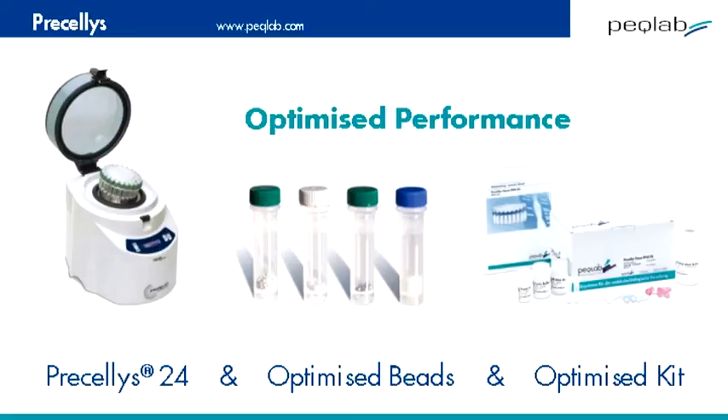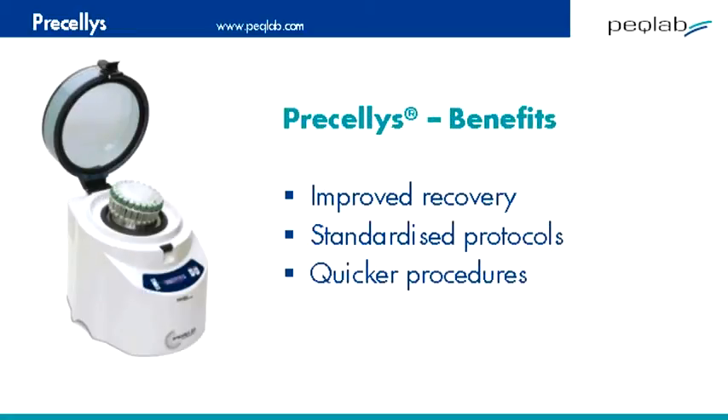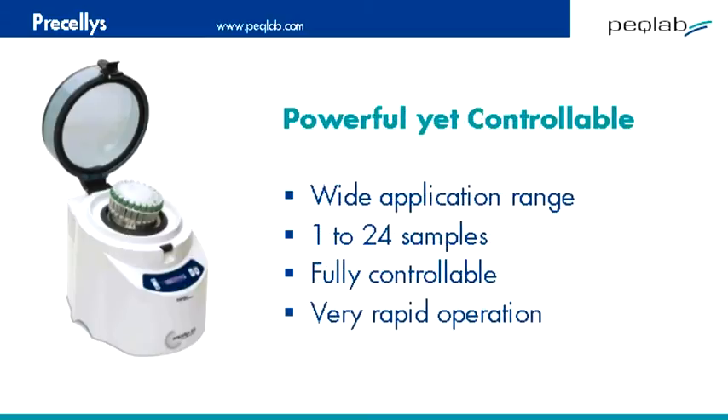In the laboratory, the Pracillis is widely used to improve the effectiveness of recovery, to help standardize protocols, and to significantly speed up many lab procedures. The system is immensely powerful but fully controllable, with program times often of seconds, not minutes.